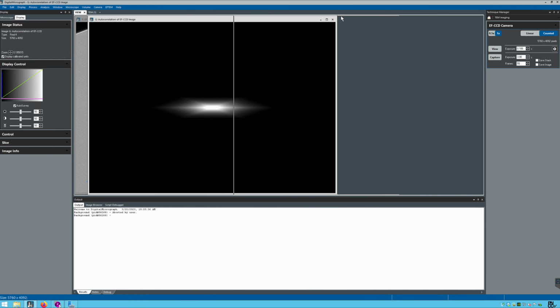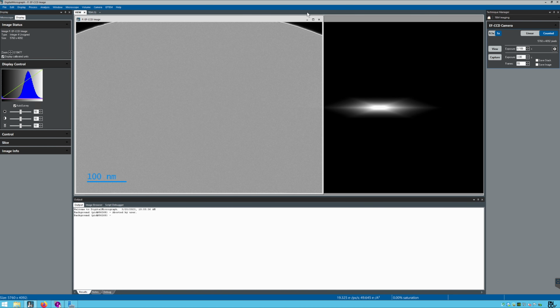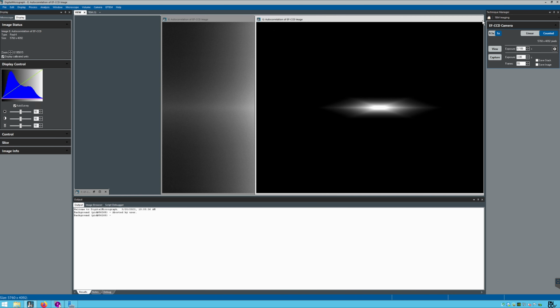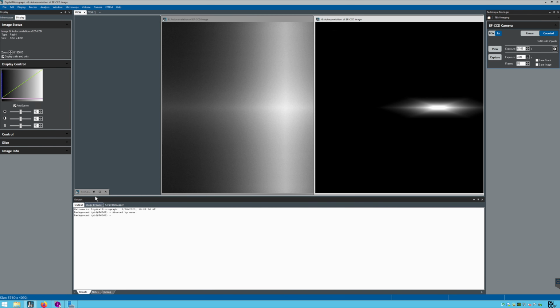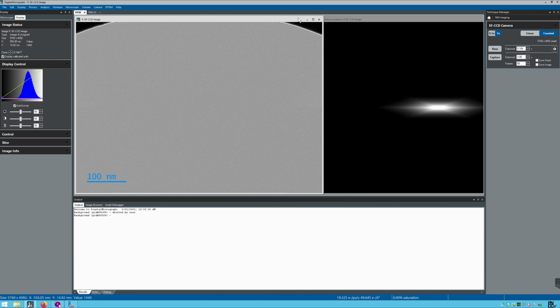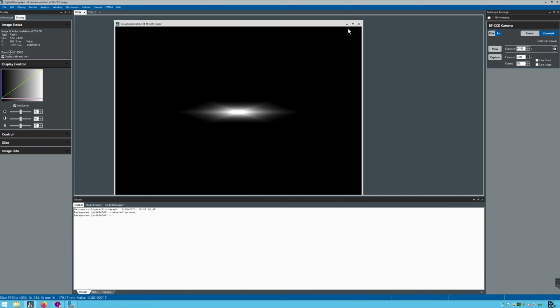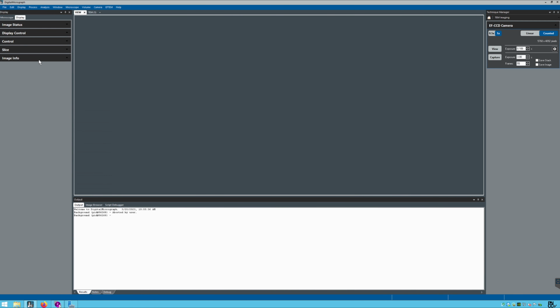If I put these two next to each other, there are these three next to each other, this is what we have. Oh, and then I don't have the good one, but it's fine. Okay, so let's close these. And we can get started with additional tuning on the microscope.